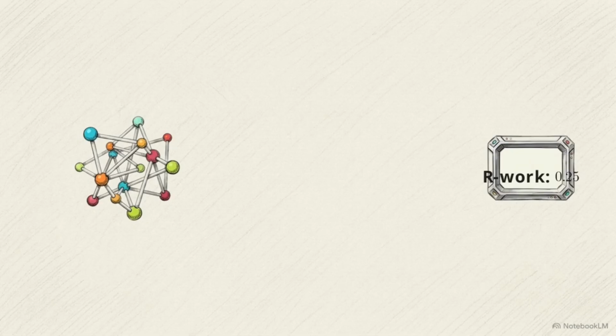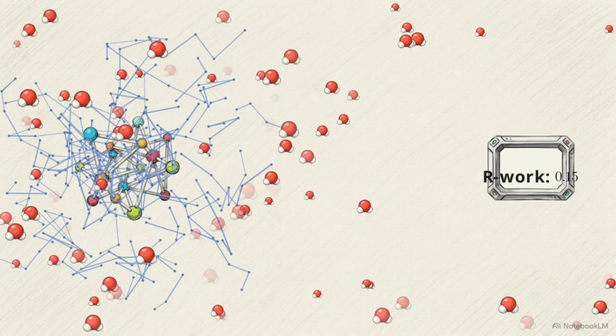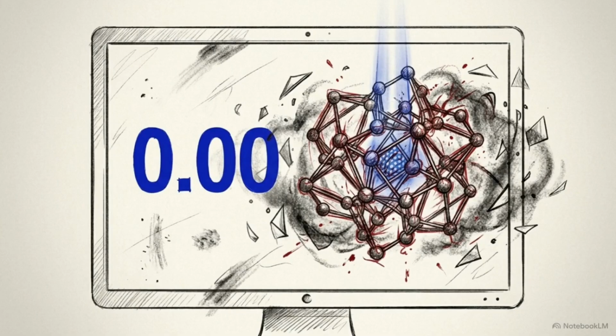A crystallographer can artificially lower their global crystallographic residual, called R work, by adding split conformations everywhere, or modeling background noise as discrete water molecules. Minimizing the global linear residual creates a dangerous illusion of fit. Math alone cannot distinguish between capturing true structural physics and simply memorizing random noise.